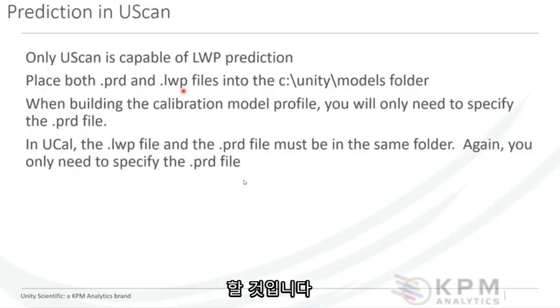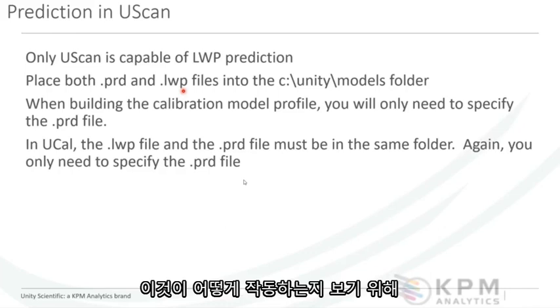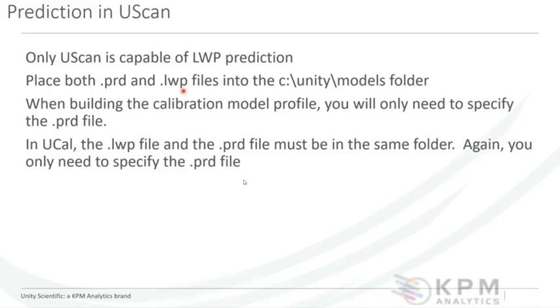So there is an exercise, a couple of exercises actually, and evaluations. This isn't a standard part of the uCal 4 class, but if this is something that you might be interested in, you might want to run through those exercises to see how they're working. But again, especially if you're starting, locally weighted regressions are not something that you will likely have enough samples for a while.